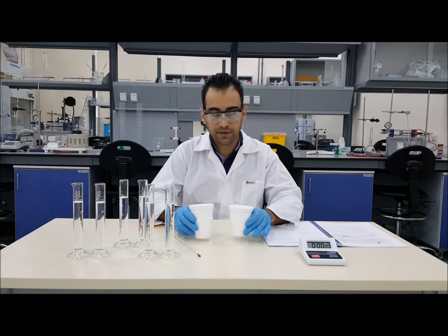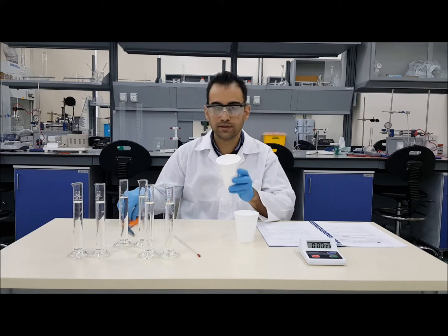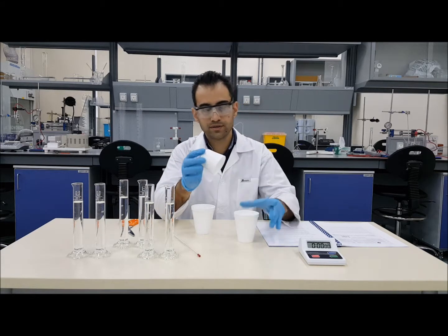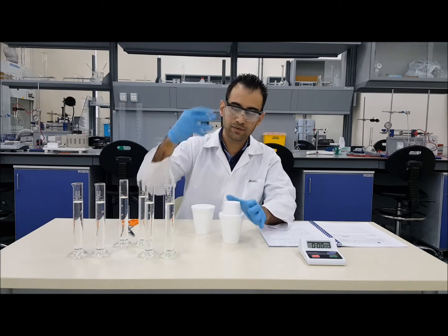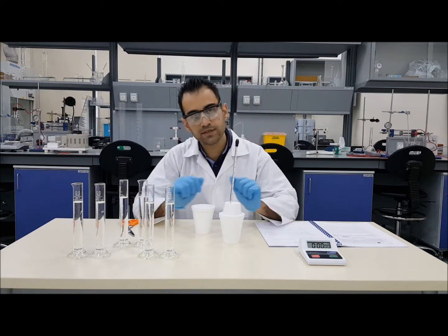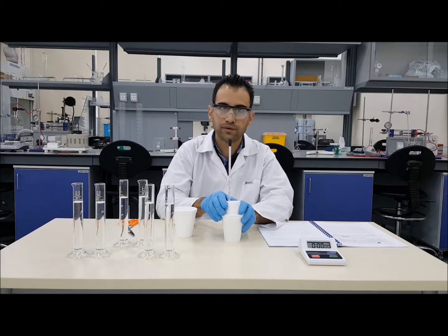We'll prepare the calorimeter first. We are going to use one polystyrene cup. Then we are going to use scissors to cut another one to form just a shorter version of it and make a hole in it. The purpose is that this will act as a cover which will fit inside the first cup, and we can insert the thermometer through the hole provided. This will make it easier for you to make sure that there is no heat escaping from the first cup, and for conveniently reading your thermometer measurements.